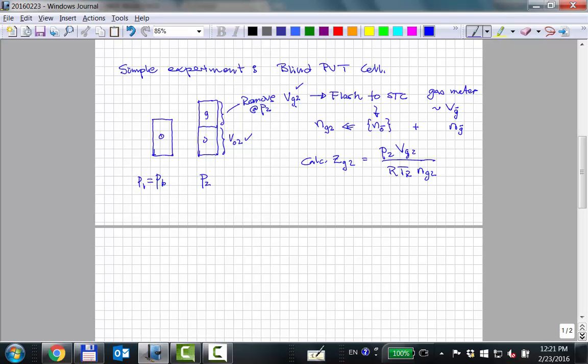You lower the pressure at reservoir temperature, and a gas phase evolves. It's brought to equilibrium, and then the gas is removed as pressure is kept constant at, in this case, P2. Remove the gas, we measure its volume, we measure the amount of moles removed, and then we can calculate the Z factor of the gas.